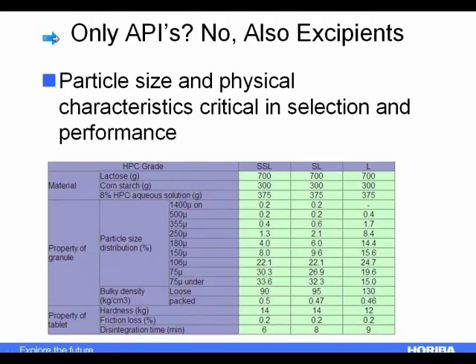If you're not aware of it, when you take a pill or tablet, only a portion of that is active ingredient. The rest is inert, or we would use the phrase excipients. And there are particle size specifications for the excipients that the pharmaceutical companies buy from their suppliers, for instance, lactose, a form of sugar. This is just a specification I saw for one grade of lactose. And you can just look at the particle size specification here and say, oh, obviously they're doing the measurement by sieves, and they're specifying the size distribution by the percent passing or retained on different sieves.